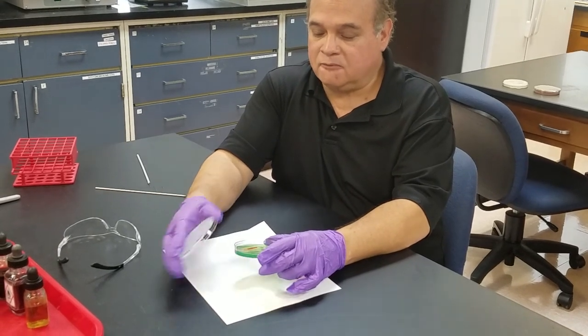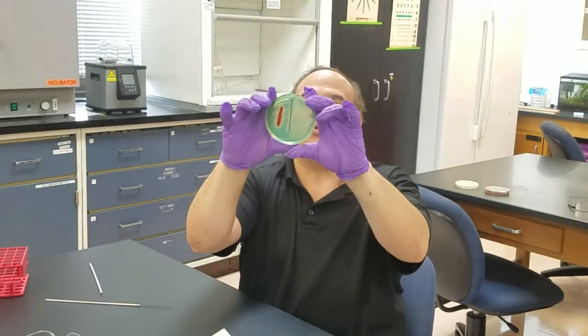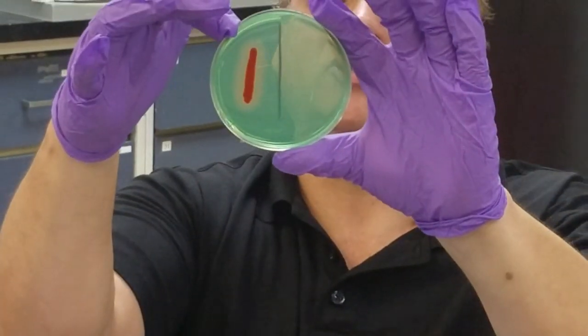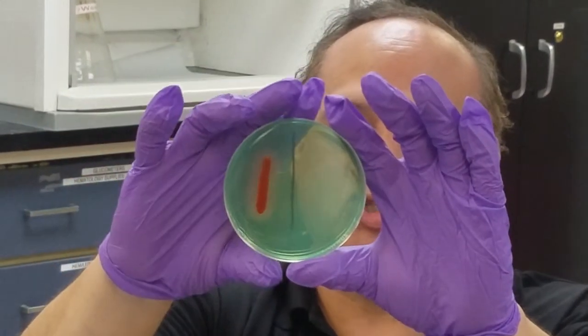If you look at these, you can see there's a clearing around this particular organism, which happens to be Serratia marcescens. But this one has no clearing and still remains green, so that's negative.